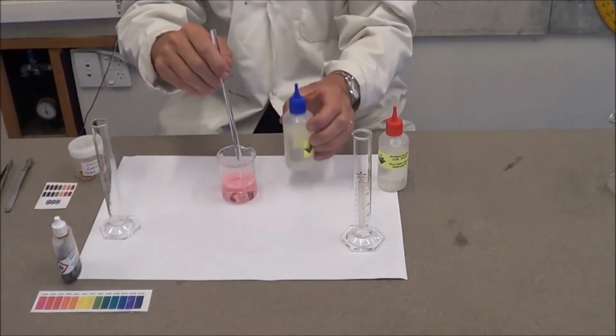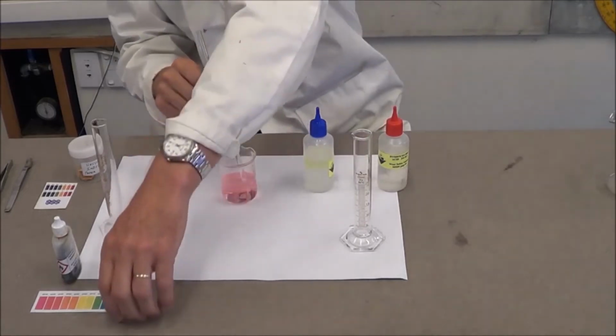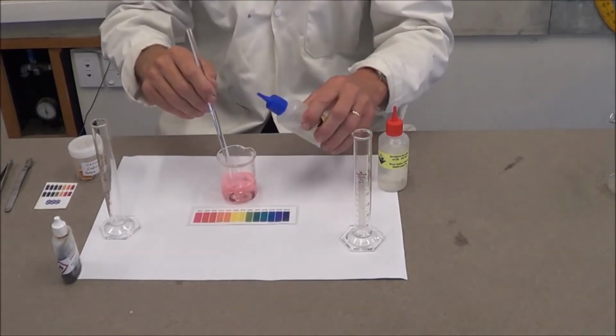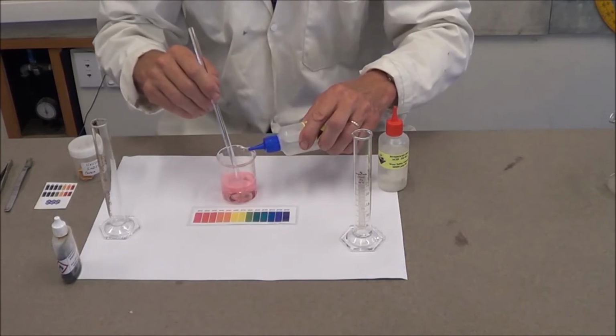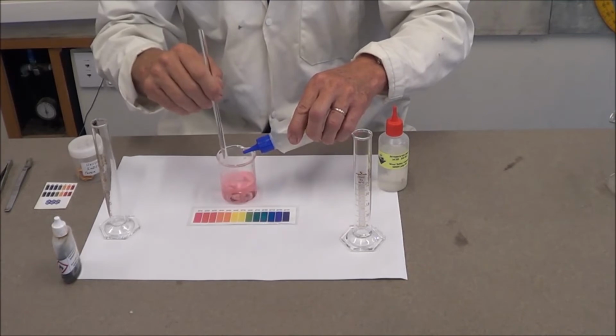We then add sodium hydroxide gradually, a drop at a time, until we have reached the pH of 7, in which case all the acid will be neutralized and hopefully there will be no extra sodium hydroxide added.